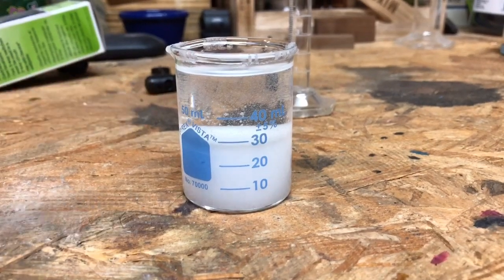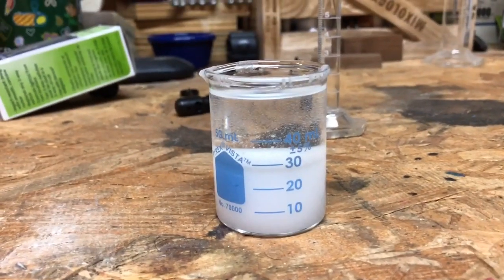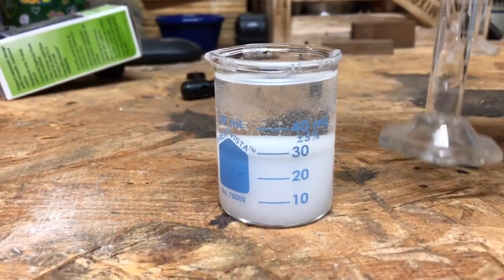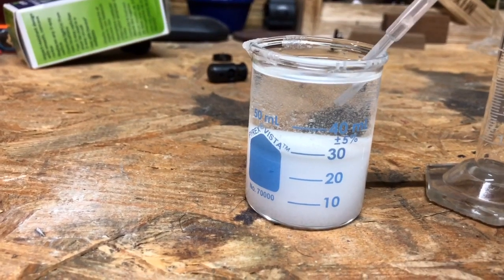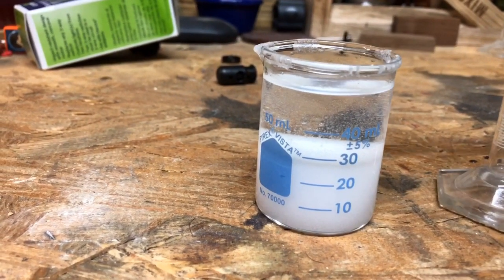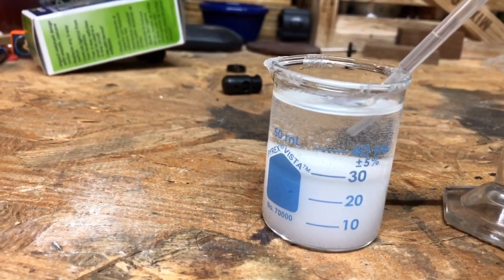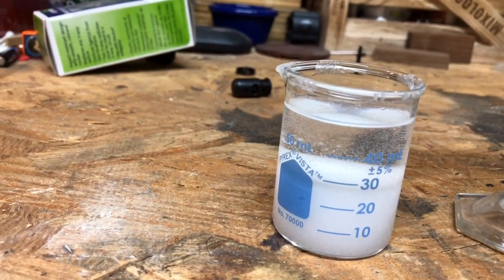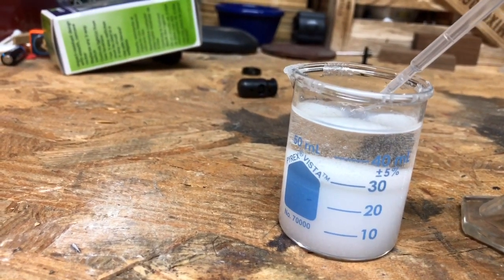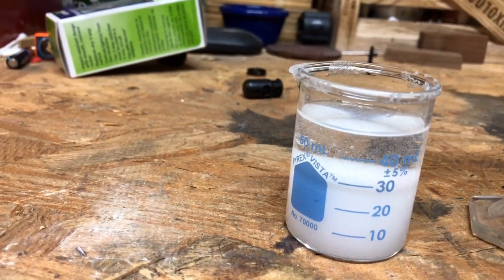That's our saturated solution. So what we're going to do is get some of that solution and put it into the graduated cylinder here. We're going to carefully take it just off of the top. We're going to go ahead and do this a few times. Okay, we're getting there.